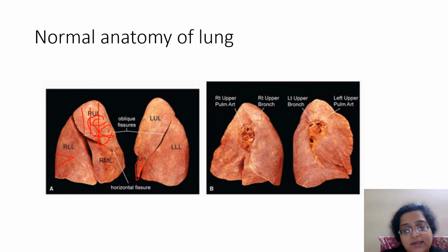This is the anterior surface, and then there'll be a posterior surface. When you turn the lung around in your grossing, you see the hilar area, and in the hilar area you need to identify the artery, the vein, and the bronchi. And then there will be some lymph nodes, some perivascular fibroareolar tissues, etc. But you have to see the vein, the artery, and the bronchi. These three things you have to identify when you are looking at a gross of a lung.